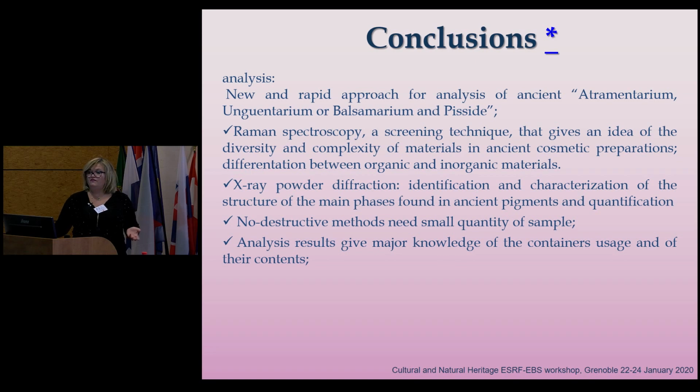If an organic matrix was present I couldn't use this, but perhaps Raman or SERS, and I had to use GC-MS and other techniques also. So Raman spectroscopy can be useful for screening thousands of samples to have identification, not quantification. Only with X-ray powder diffraction, and only here in Grenoble at ID22, was identification and composition of these powders possible.